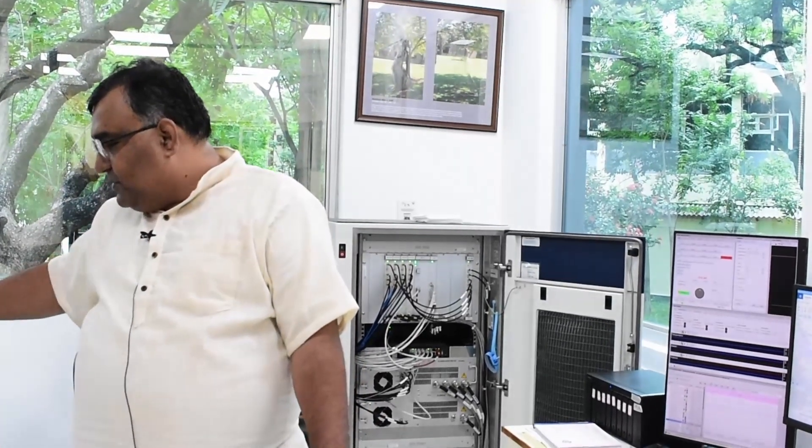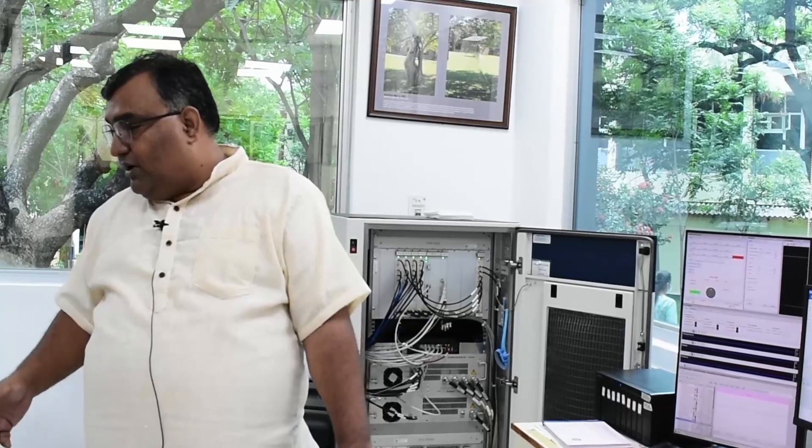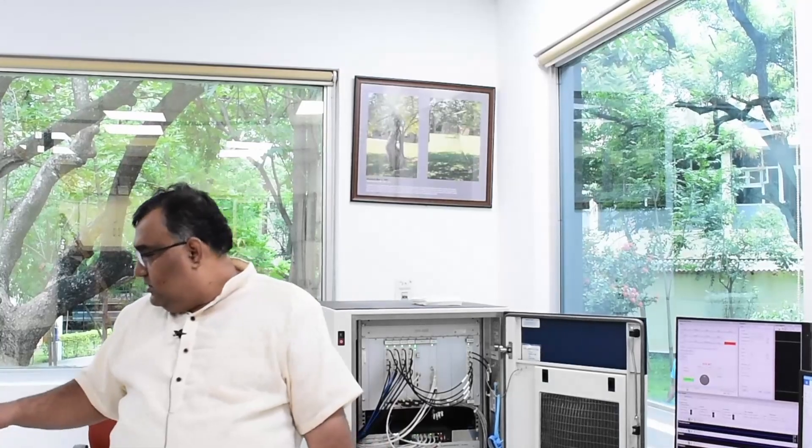So one can think of how much technology would have gone to get something like this. This is probably one of the best technologies. And now with James Webb Space Telescope, the cooling of helium, they have come up with a newer technology. So I am sure that in times to come, in another 5 years or something, even this box will go away, and that will be integrated with the probe itself. So more or less every probe could even become a cryoprobe.